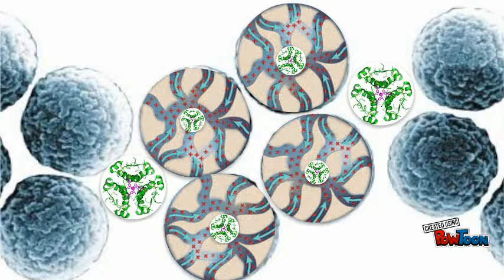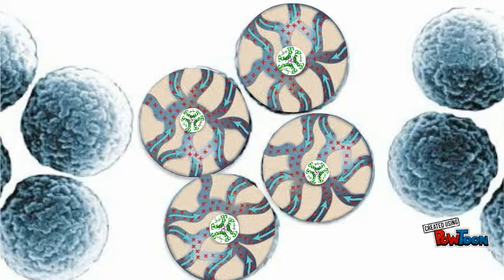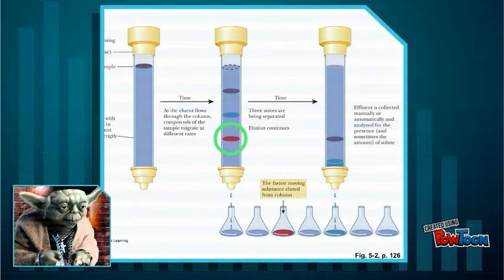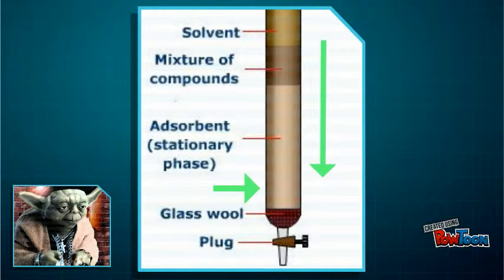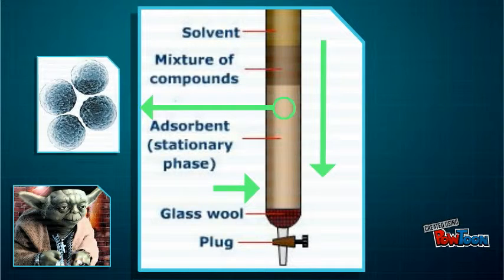Through this process, larger molecules exit the gel first, while smaller molecules travel through the network of tunnels, lengthening their transition through the column. Each filtered solution is collected in stages, or fractions. Each fraction contains progressively smaller molecules. There are qualities of the column that affect its efficacy. The longer the column, the greater the separation. The wider the column, the greater quantity allowed through at any given time. The larger the beads, the more power behind the resin.